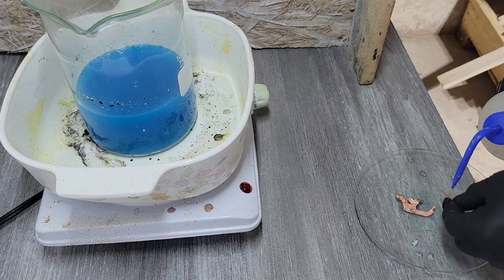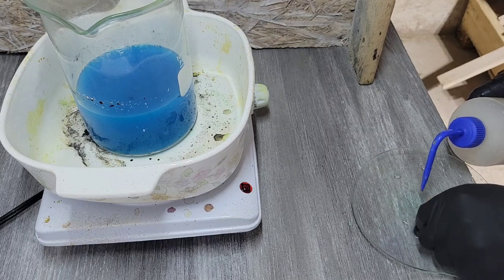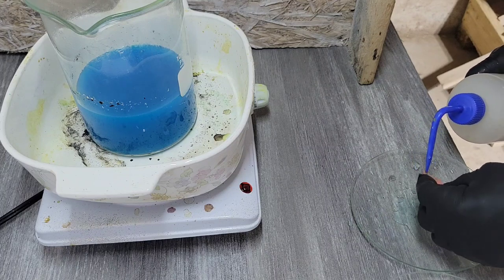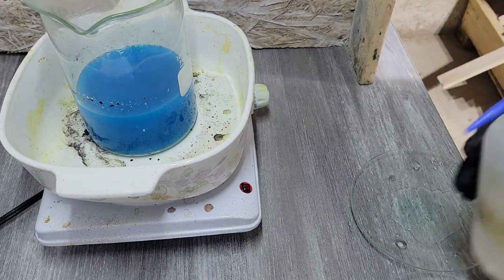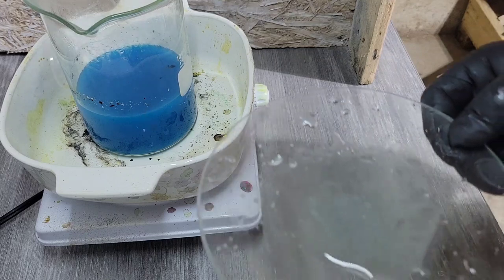Nitric acid that's still in solution here is actually cementing out the silver on this plate. I don't know if you can see that in the video. Very little amount.